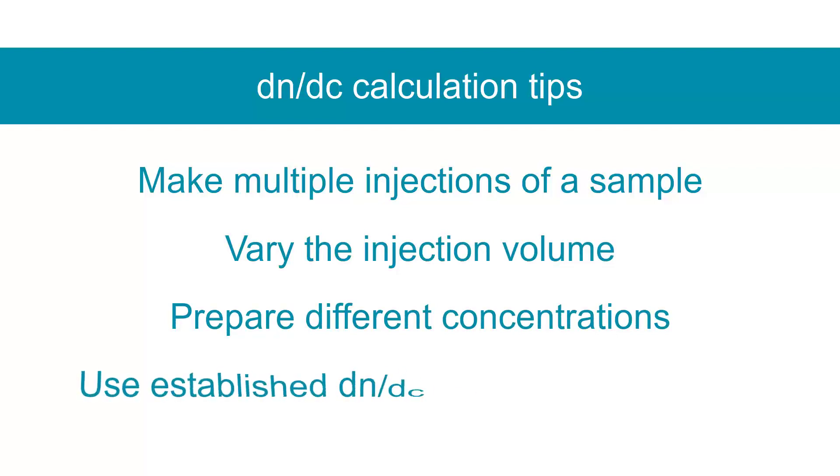Once you have an established DNDC value for a specific sample type in a given solvent, it is best to apply that value to all analyses of identical samples.